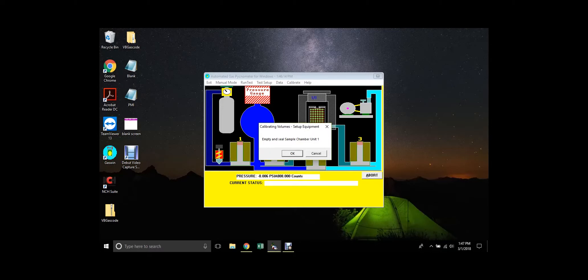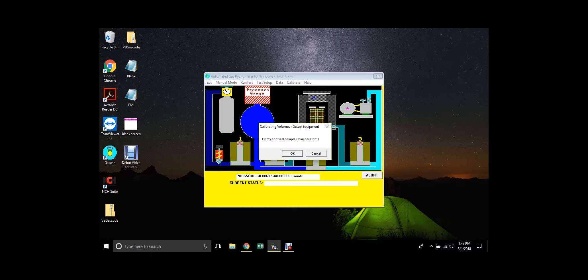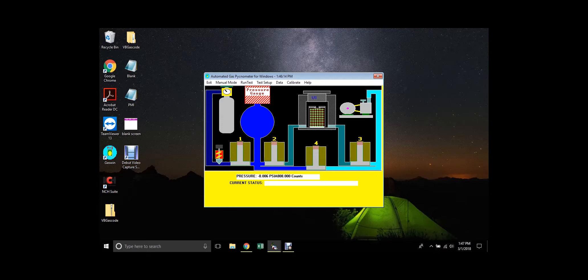Upon completion, the software will display the sample chamber volume and the reference volume, and these values will be saved in the software to use in calculations when testing subsequent samples.